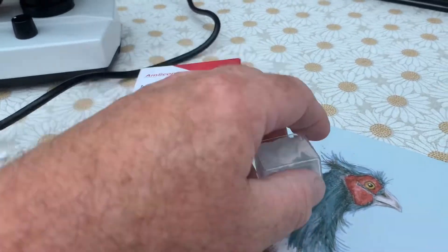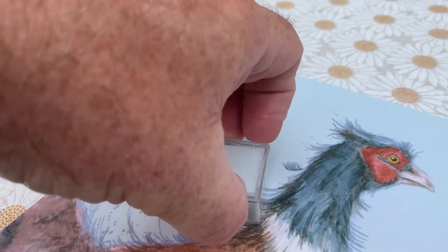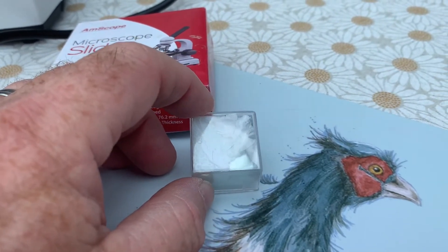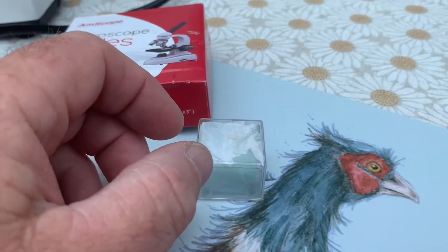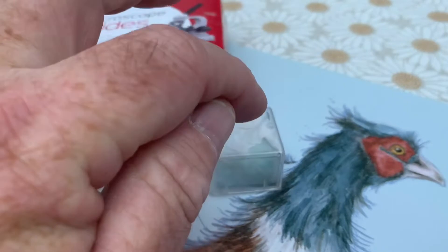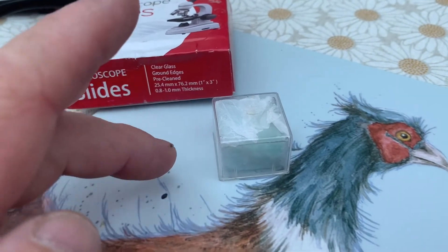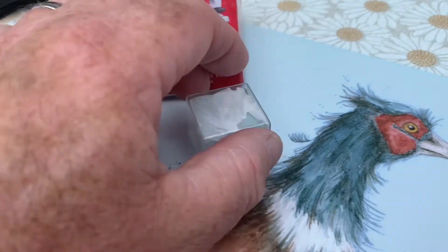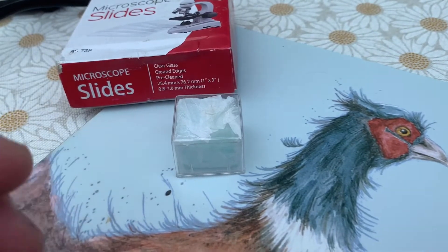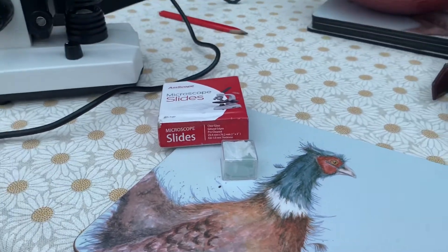And then you have these little cover slide covers — they're a really thin piece of glass. Just use one, and be careful when pulling them out because you can accidentally grab three or four. Drop one over the top of your sample but don't push it down, otherwise it'll stop anything you're trying to find from moving. Get your mucus sample onto the slide, drop the cover slip over the top, wipe any excess water or mucus from the bottom of the slide, then place it in the microscope.